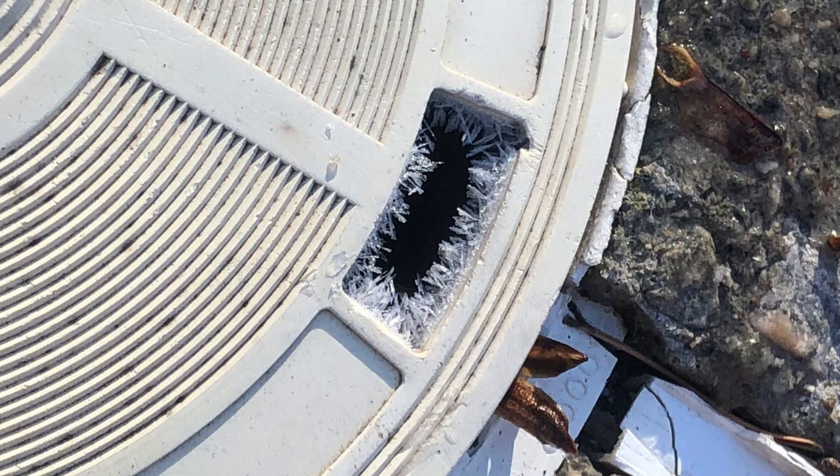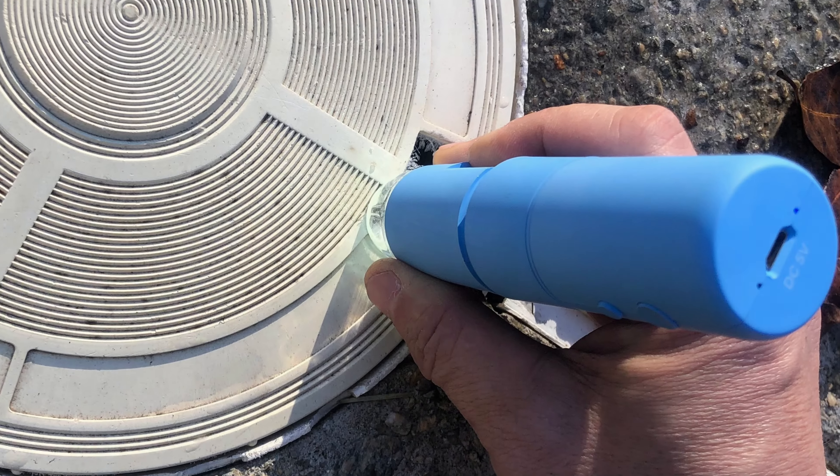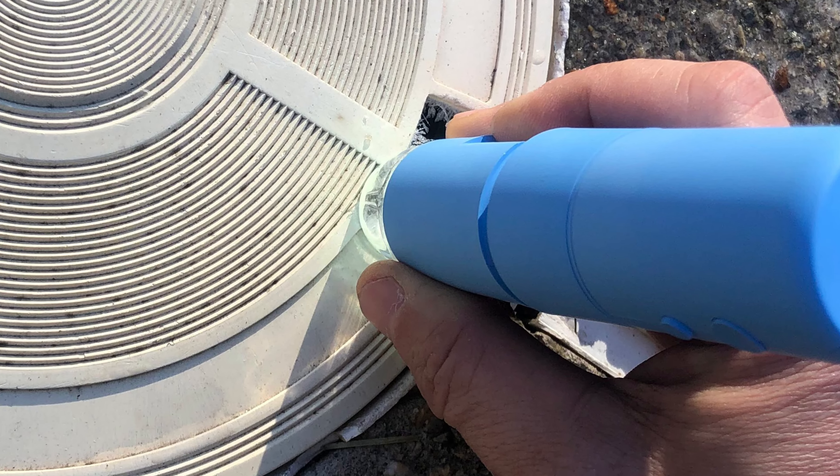Just this morning I looked at my skimmer in my pool and I saw these ice crystals. Because this is the cheaper microscope, you have to dial in the zoom with a scroll wheel on the side of the microscope.